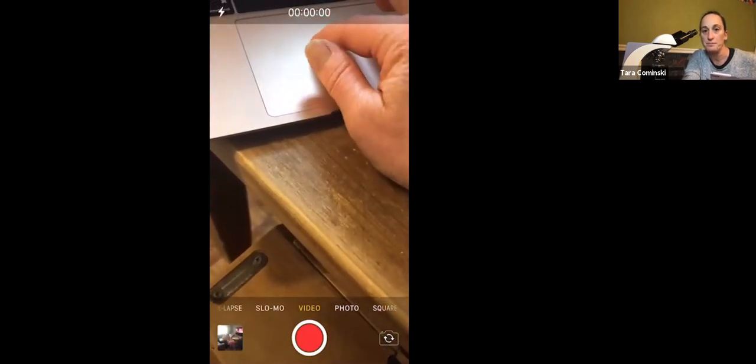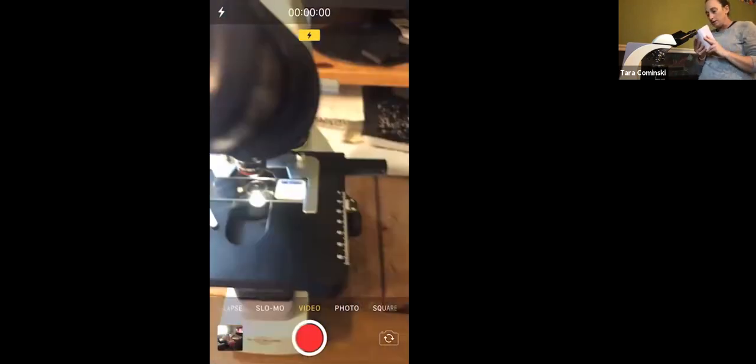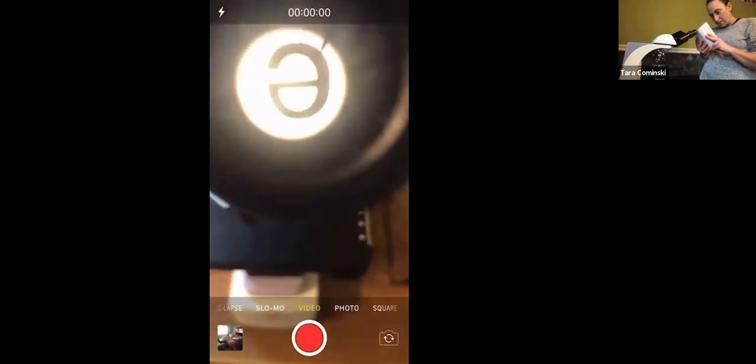All right, so now I focused it using the coarse adjustment, and let's see what it looks like. Okay, so it's a little more clear, but notice, when I put it in and look at it with my naked eye, it's the letter E, the way you would normally see the letter E. What do you notice about what it looks like now?